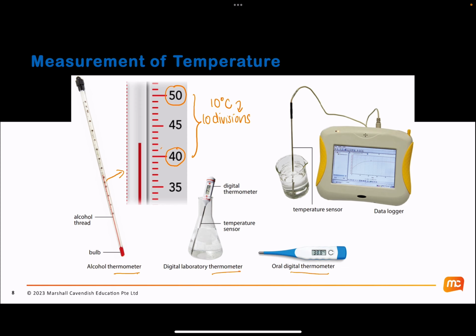So this is a 41, this is a 42, 43, 44, so on and so forth. So it's quite simple. This particular value that you see over here actually lies between 42 and 43. So if I were to record it, I will record it as 42.5 degrees Celsius.